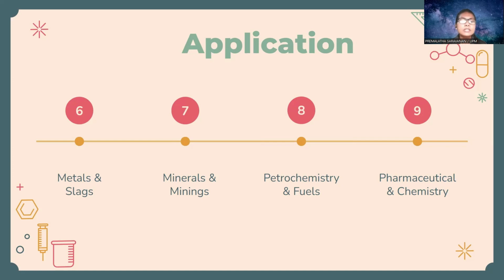For example, the sulfur concentration in ultra-low sulfur automotive fuel ULSD following the EPA Tier 3 or Euro V, which is the benchmark or the standard, is analyzed according to ASTM D2622 with WD-XRF spectrometer.